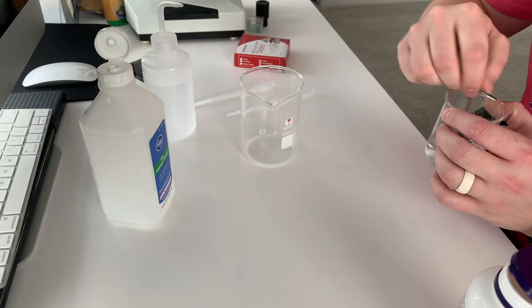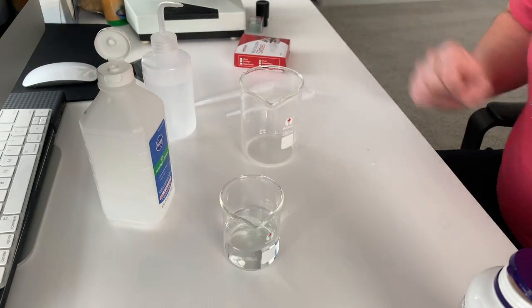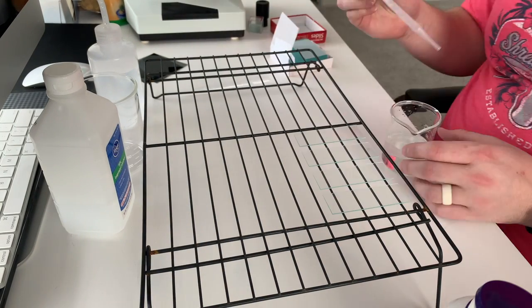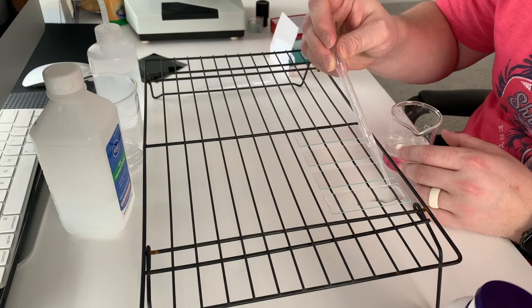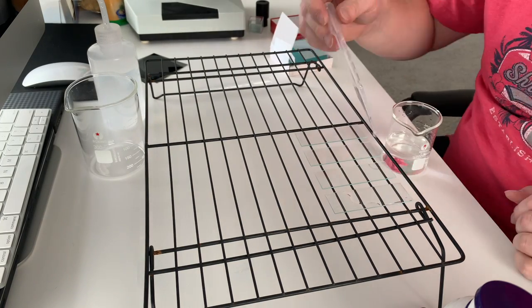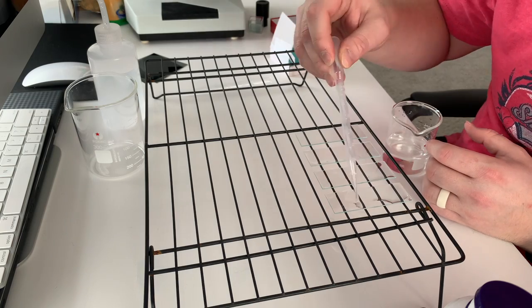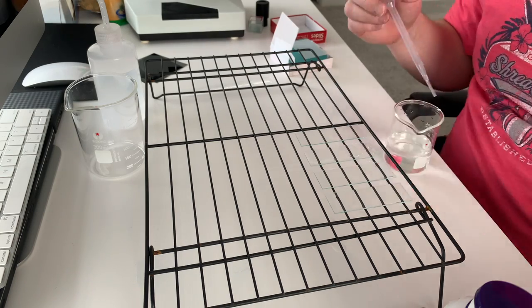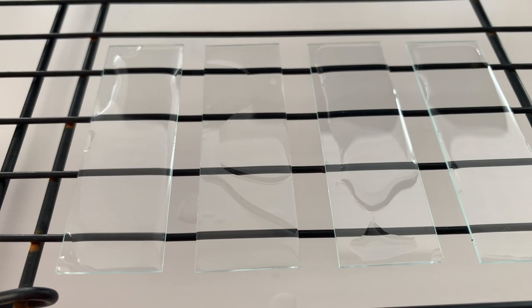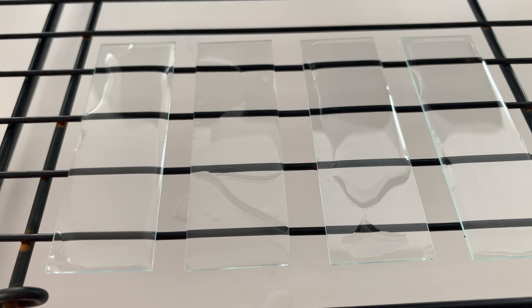I'm just blending things together in this little beaker here. You don't really need a beaker, but I just have some because they make me feel more fancy. Then I'm placing the mixture on the slides, trying to cover the whole slide. If you have just water, it's really hard because the water kind of builds up due to surface tension. But if you use the alcohol, it helps. Some of these had a little bit more alcohol than the others, like the one on the far right.